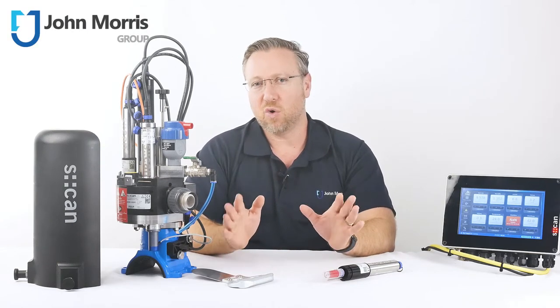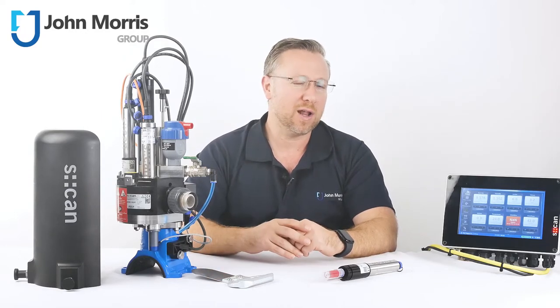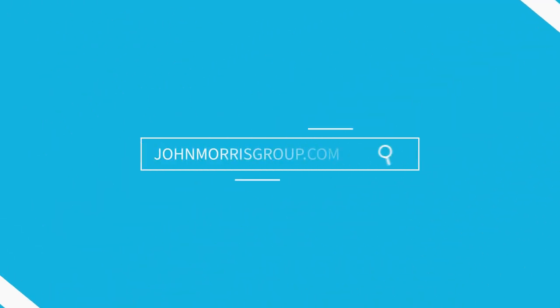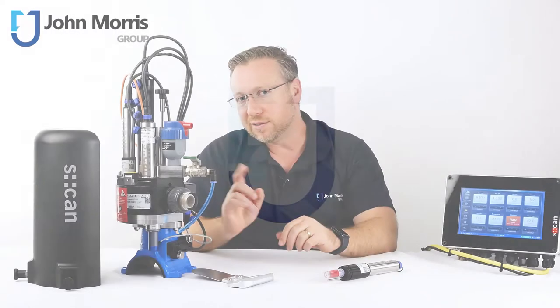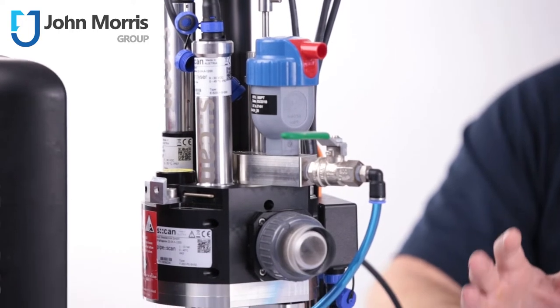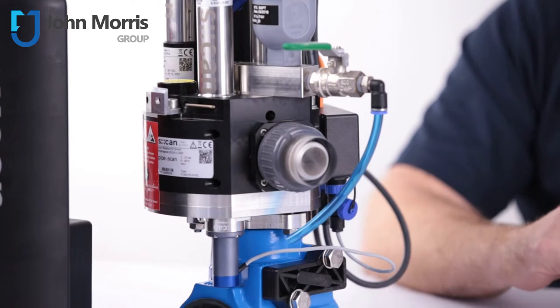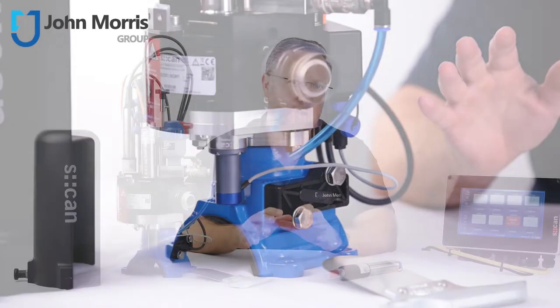Hi, I'm Andre from the John Morris Group. Stick around for the next 90 seconds to learn all the key features of this real-time drinking water network analyzer from Badger Meter S-CAN. This is the PipeScan. It's a unique water quality analysis solution which enables potable water producers to understand the quality of their drinking water in pressurized pipes at any location throughout their network and in real time.